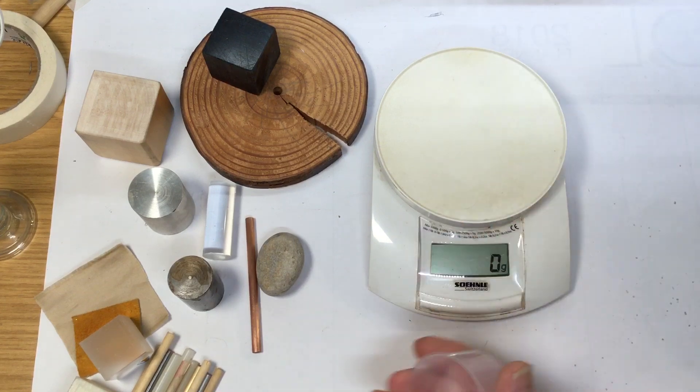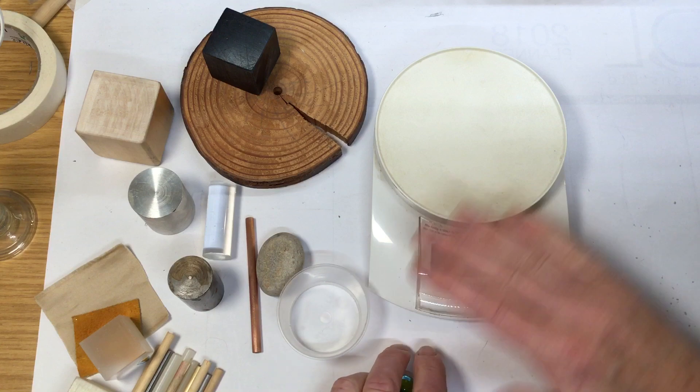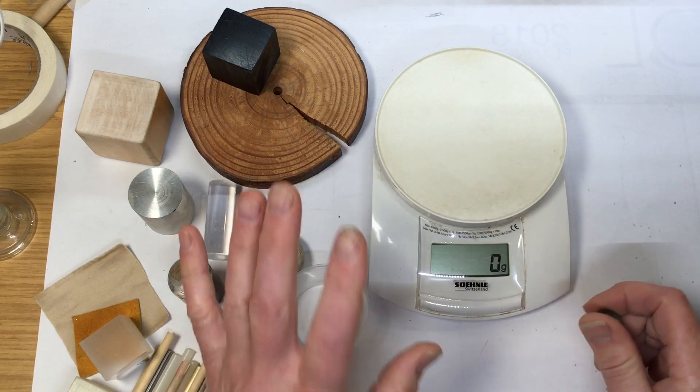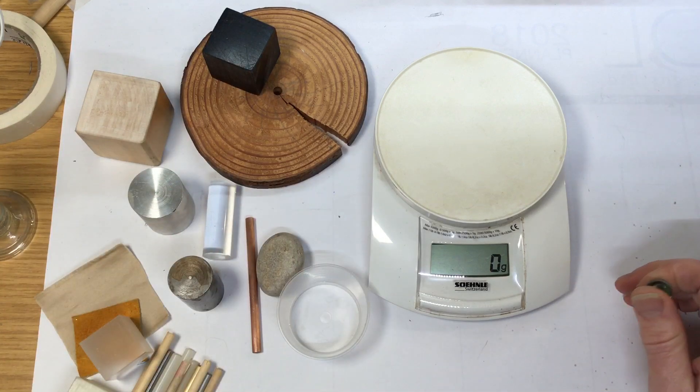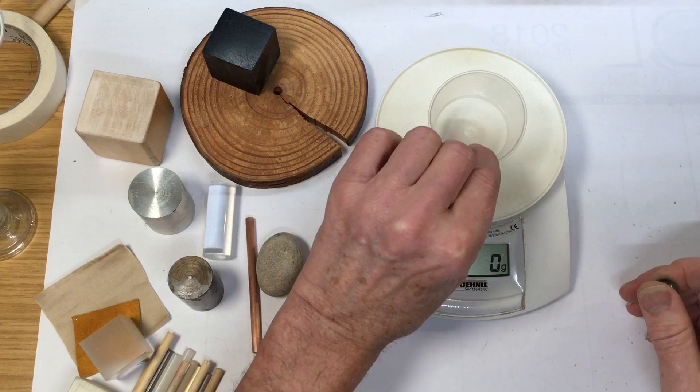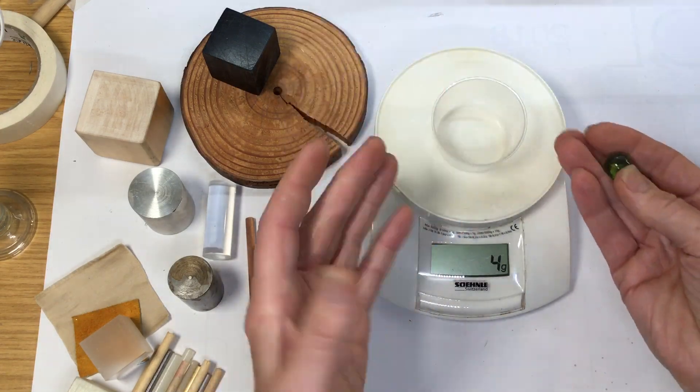So, zero on the scales at the moment. You should always leave them switched on for five minutes, ten minutes, half an hour for more complex scales. Let's put on the little container - remember, powders and liquids you want to put them in a container. Four grams.